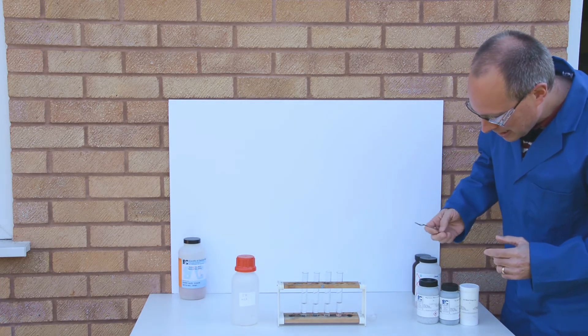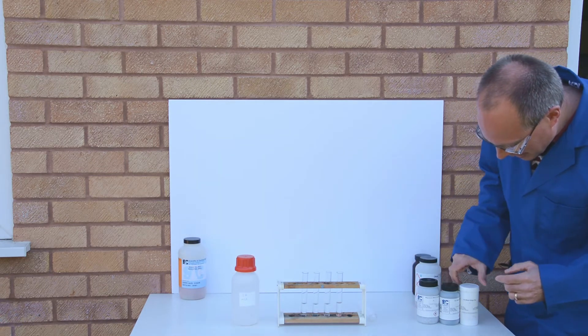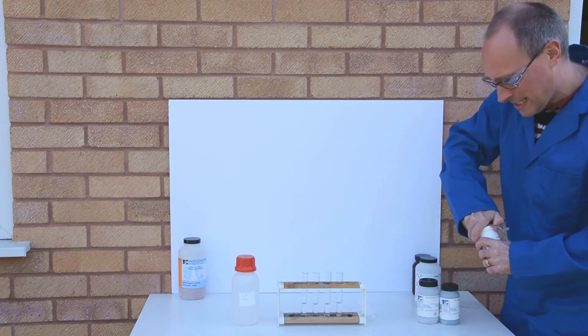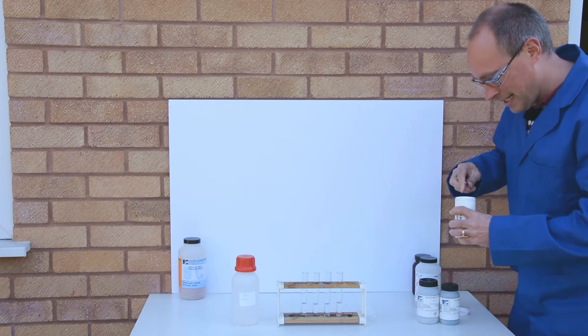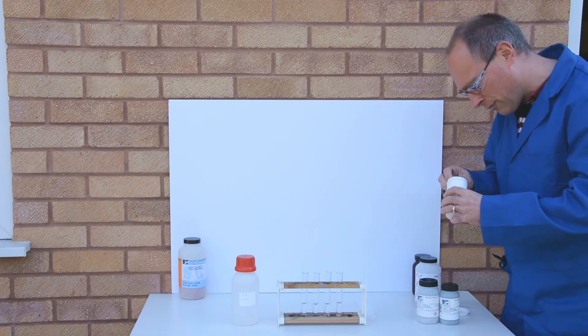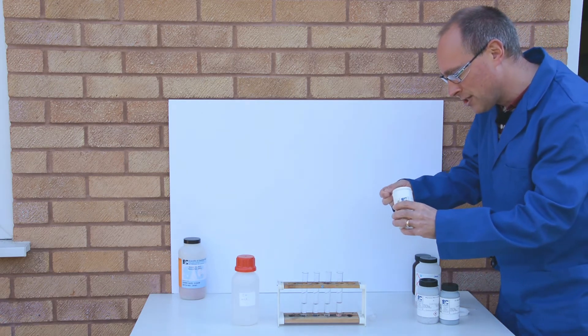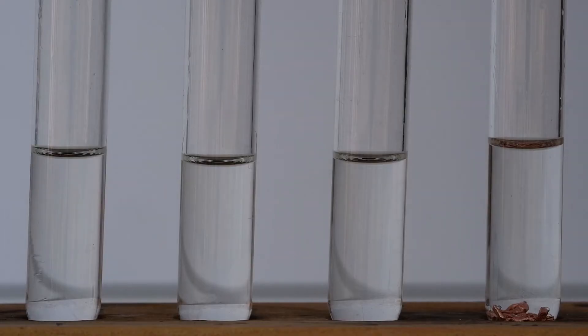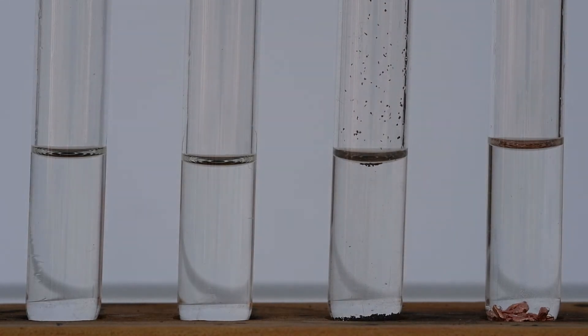In the second test tube I'm going to put a little bit of iron, and again we'll look for evidence of any chemical reaction. So the iron filings here, just put into the acid there.